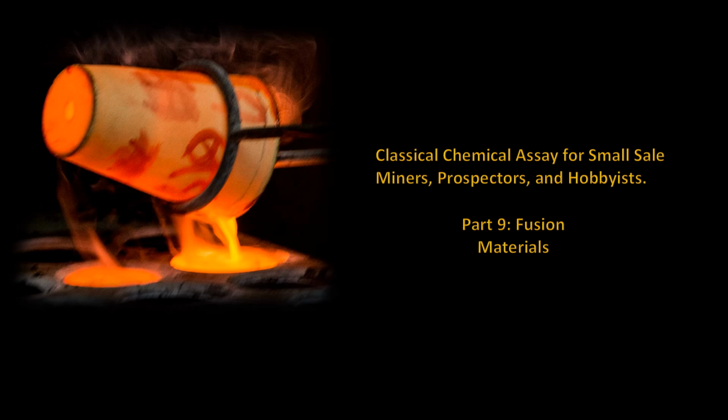In Part 8 of this series, Classical Chemical Assay for Small-Scale Miners, Prospectors, and Hobbyists, I discuss some of the intricacies in regards to dissolving rock, soil, and concentrate samples for qualitative and quantitative analysis.